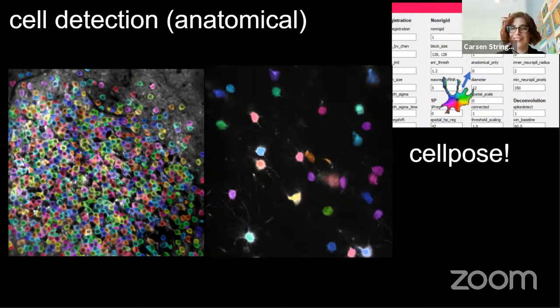It can also require a lot of RAM. The person I know who did it used a lot of compute at the institute he was at. But that can be an option to run across multiple days. You have to be careful that the alignment is good, that you don't need a very big non-rigid shift between days to be able to match the cells across days. If there are really big non-rigid shifts, you probably will want to run each day separately and then post hoc combine traces, match cells basically.